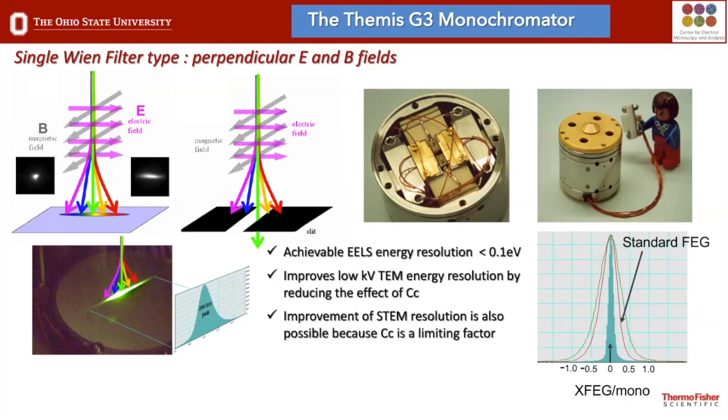And the energy dispersion, unfortunately, had to be compromised. But it's okay because, again, you have the monochromator. And now what you see here in this blue fill is what we get with the monochromator excited. That's about a 200 millielectron volt full width half max.